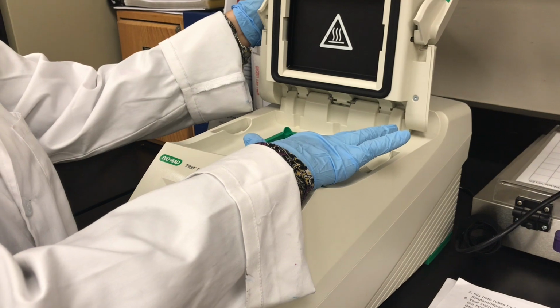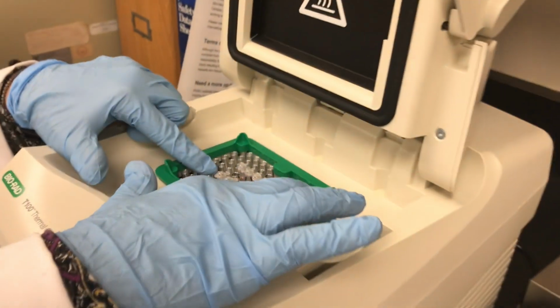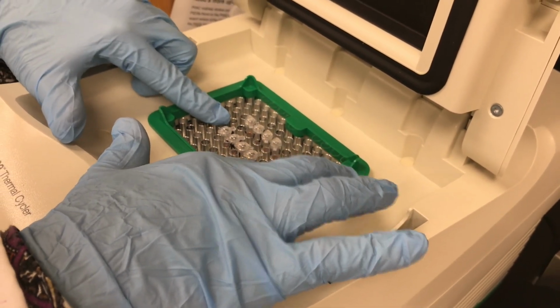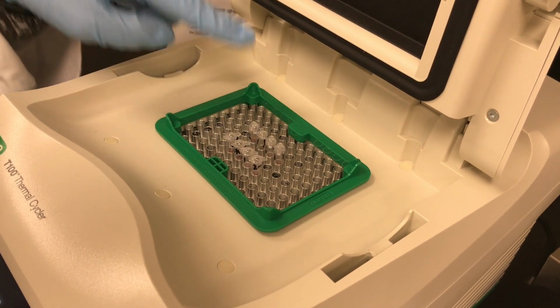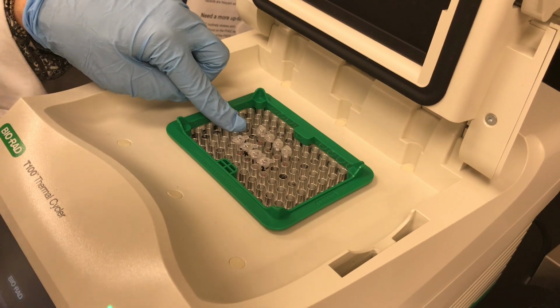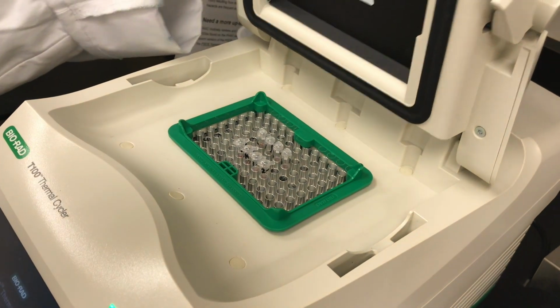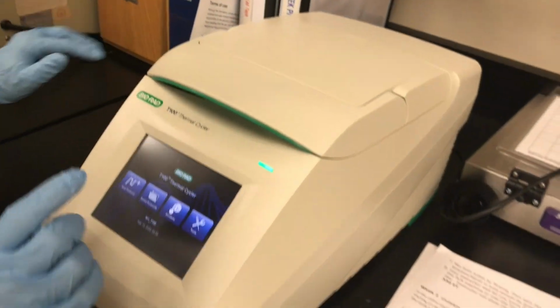This metal part is the temp block that's going to be changing temperatures for the PCR reaction. So in a different segment, I'm going to talk about PCR and everything that's going on. But this is the temp block that will be changing temperatures, because we're going to do a polymerase chain reaction. PCR is a cycle, and it's a cycle of temperatures. So this machine is going to do that cycling for us.